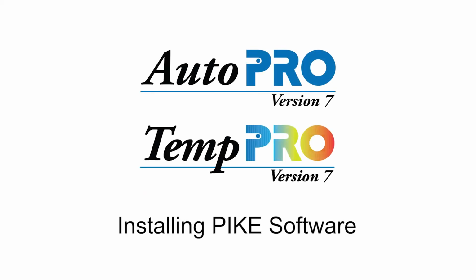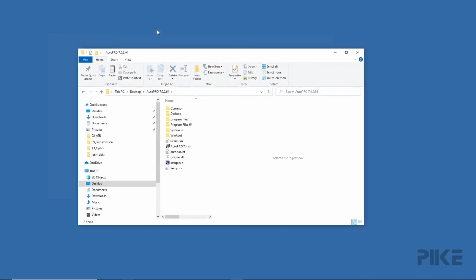Hello, this is a tutorial on how to set up the Pike TempPRO and AutoPRO software. Now the setup procedure is similar for each, so I will be demonstrating on the installation of AutoPRO. But everything we cover here is also applicable to the TempPRO installation.